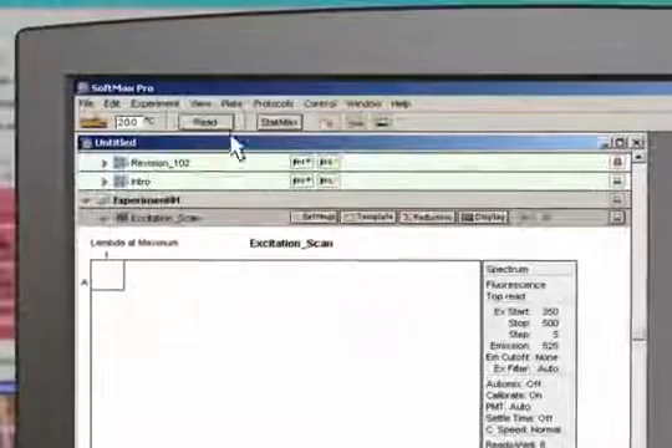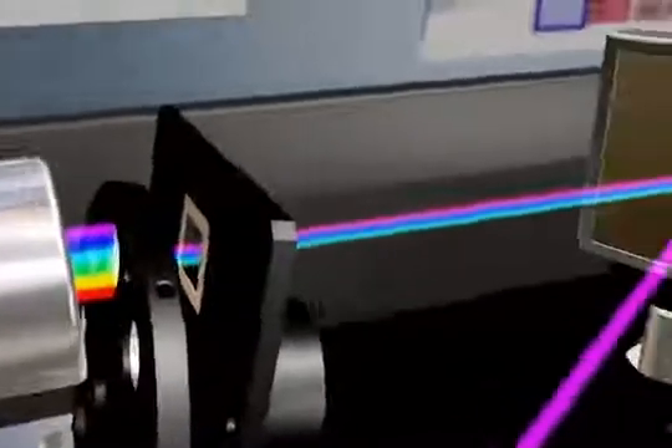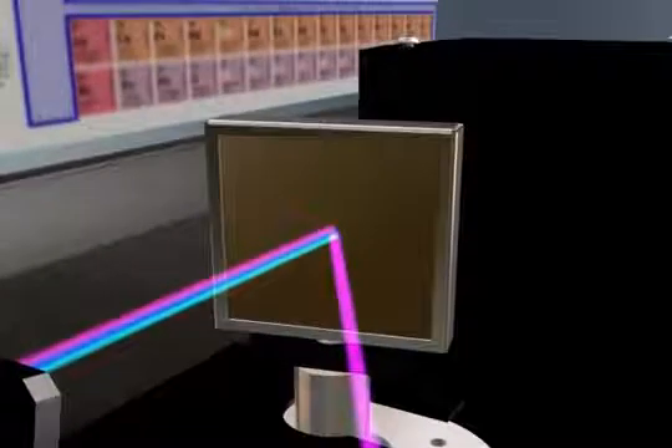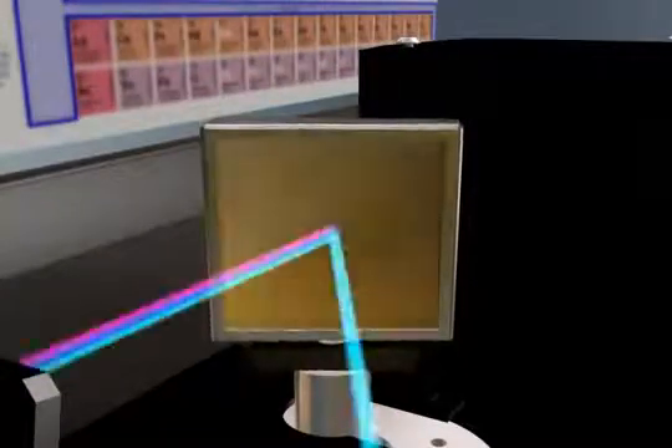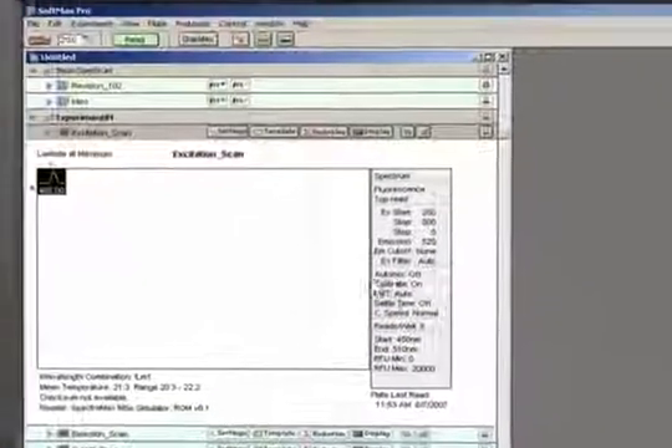Once you click Read, SpectraMax automatically selects the proper cutoff filter and scans the monochromator through the selected excitation wavelength range. This raw data is processed by Softmax Pro and we are presented with a real-time graph of the results, complete with the excitation maximum.